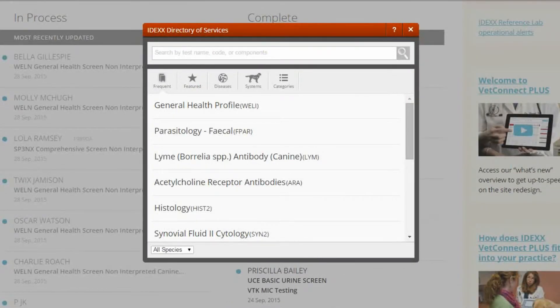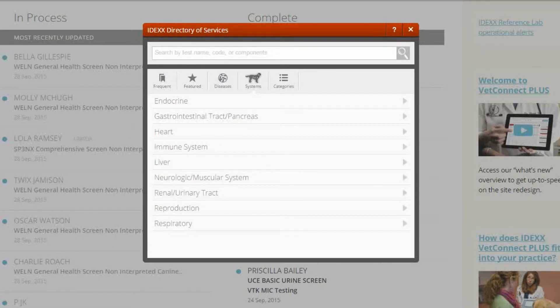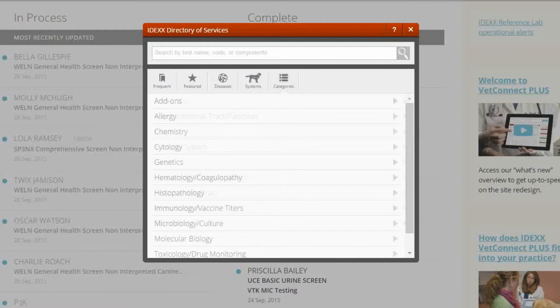Tests are also organised by category. The frequent category includes tests your hospital orders most often. You can also find tests by disease or body system, and categories list tests by methodology such as chemistry or microbiology.